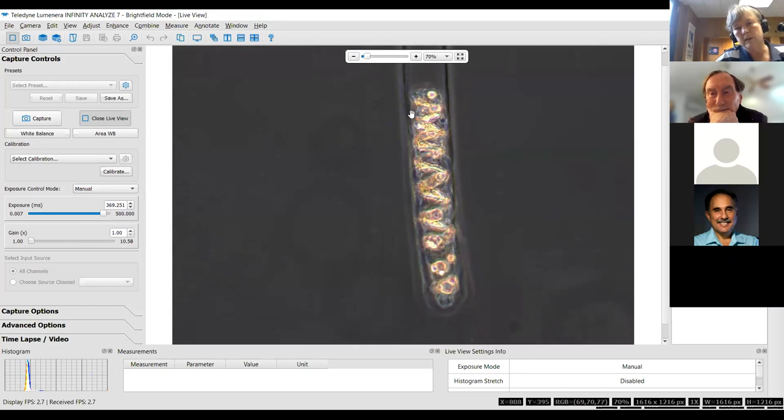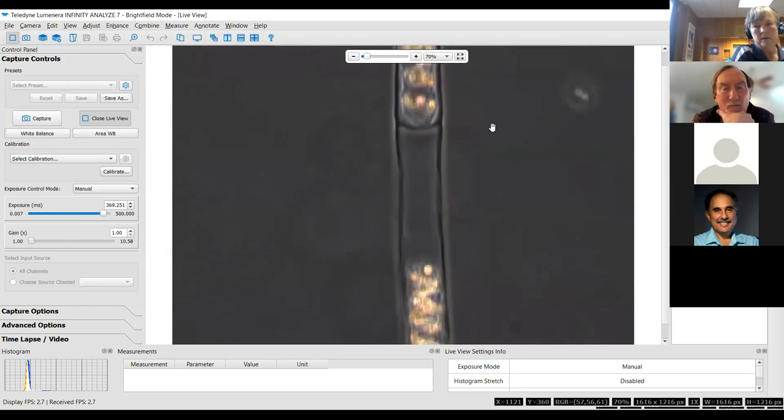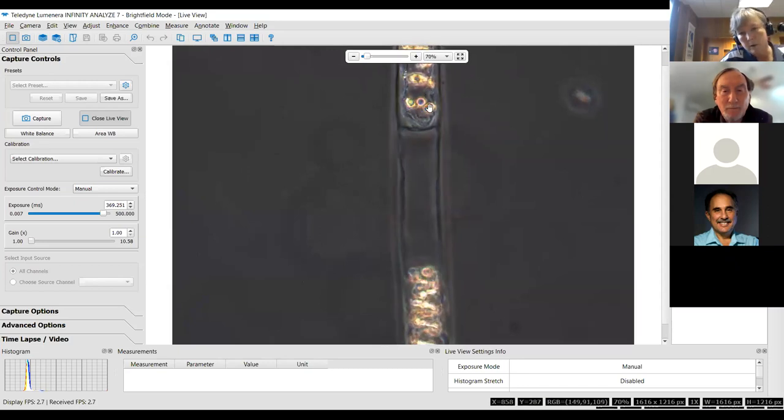It's got a nice strong cell wall. You can see the differences between the cells. See right there, that's a nice cell wall in between the two cells. And here's the one from the cell above it. And actually with this one, what you're seeing at the bottom part of this chloroplast are the pyrenoids that are left over.